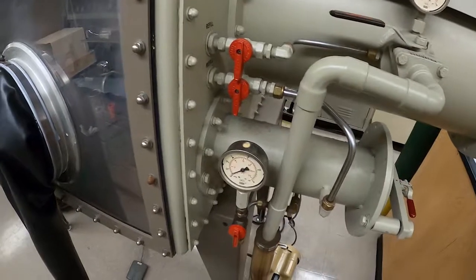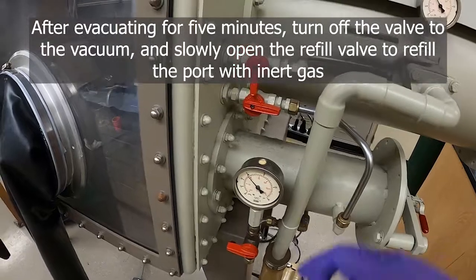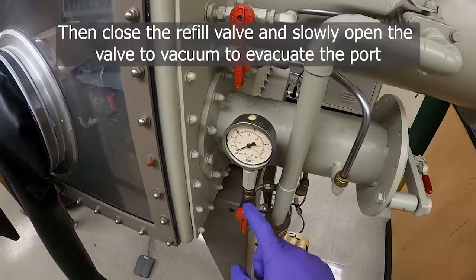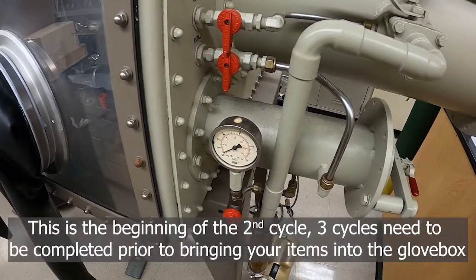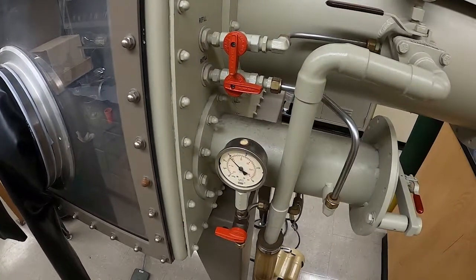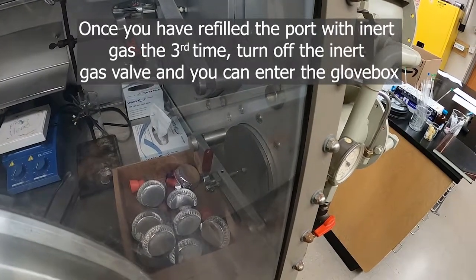For demonstration, we would close the vacuum side, open the refill valve, and you can see that brings the pressure back up. Then close the refill and open the vacuum again — this would be the start of the second cycle. There would normally be five minutes between these steps. After refilling the third time, that's when you can go into the glove box and remove your items from the port on the inside.